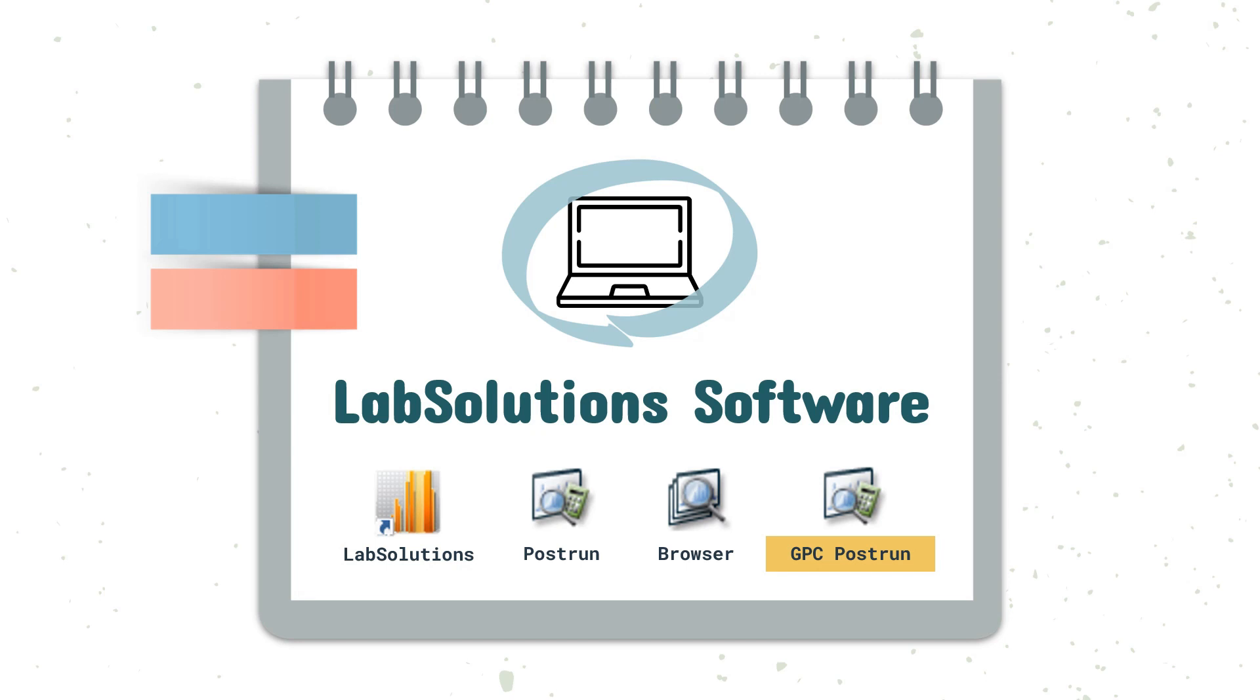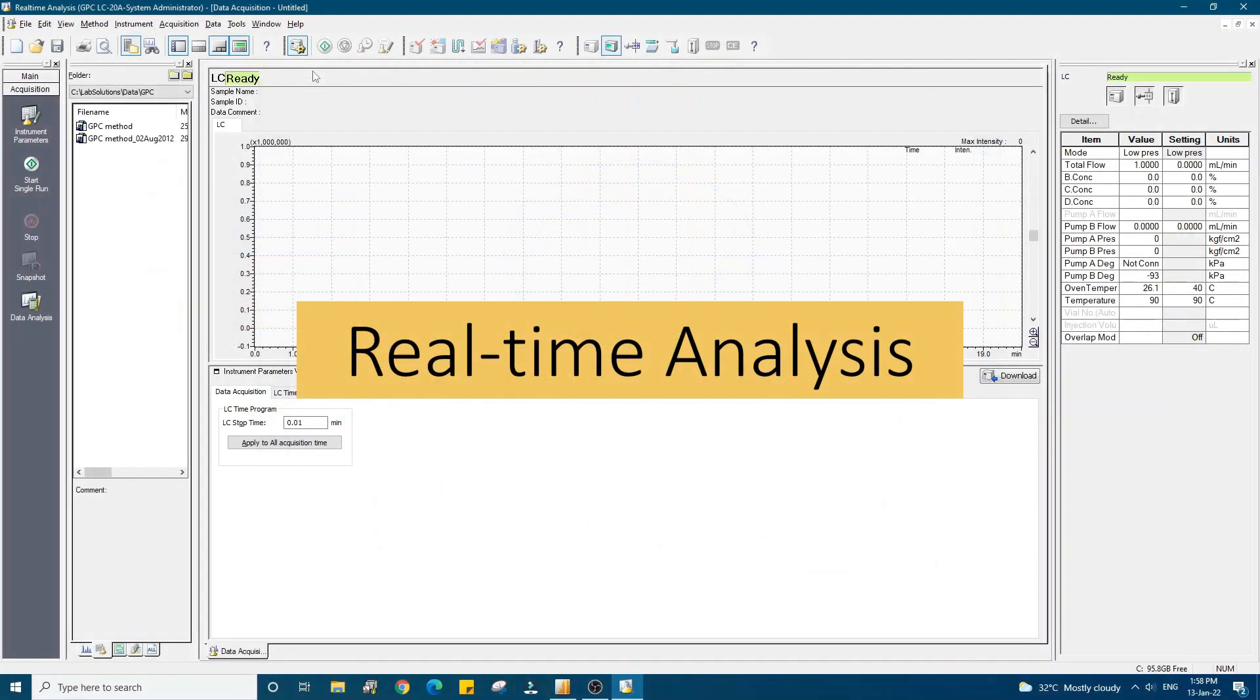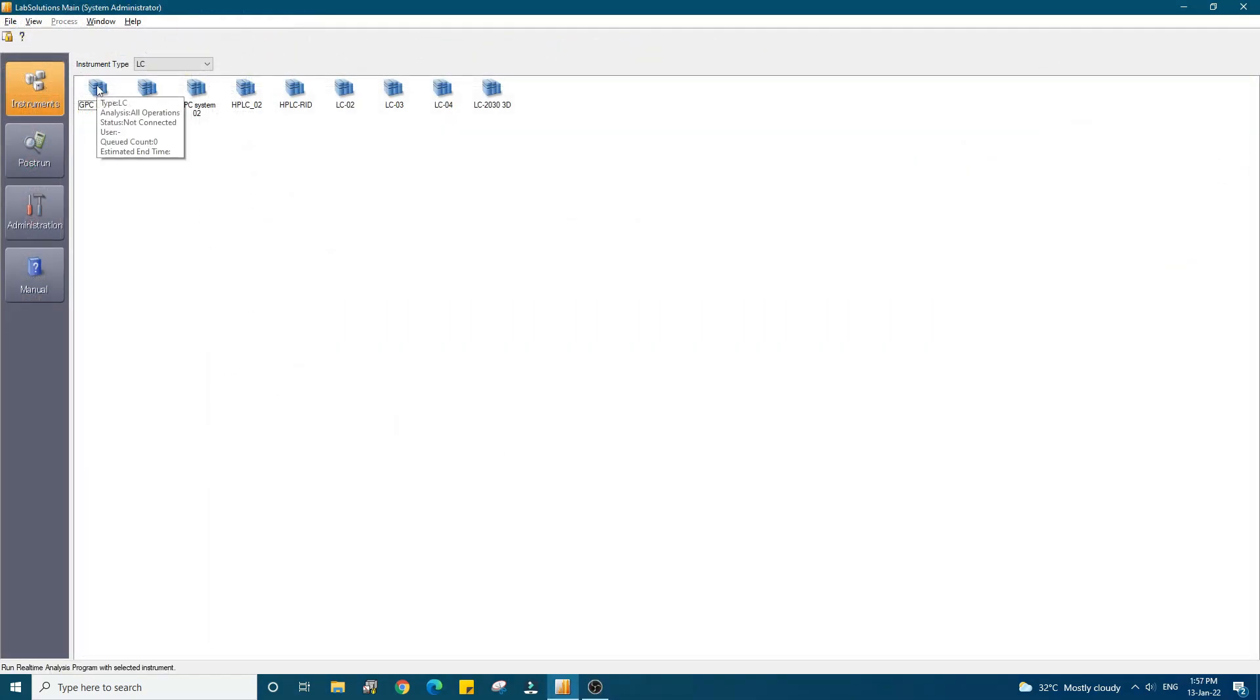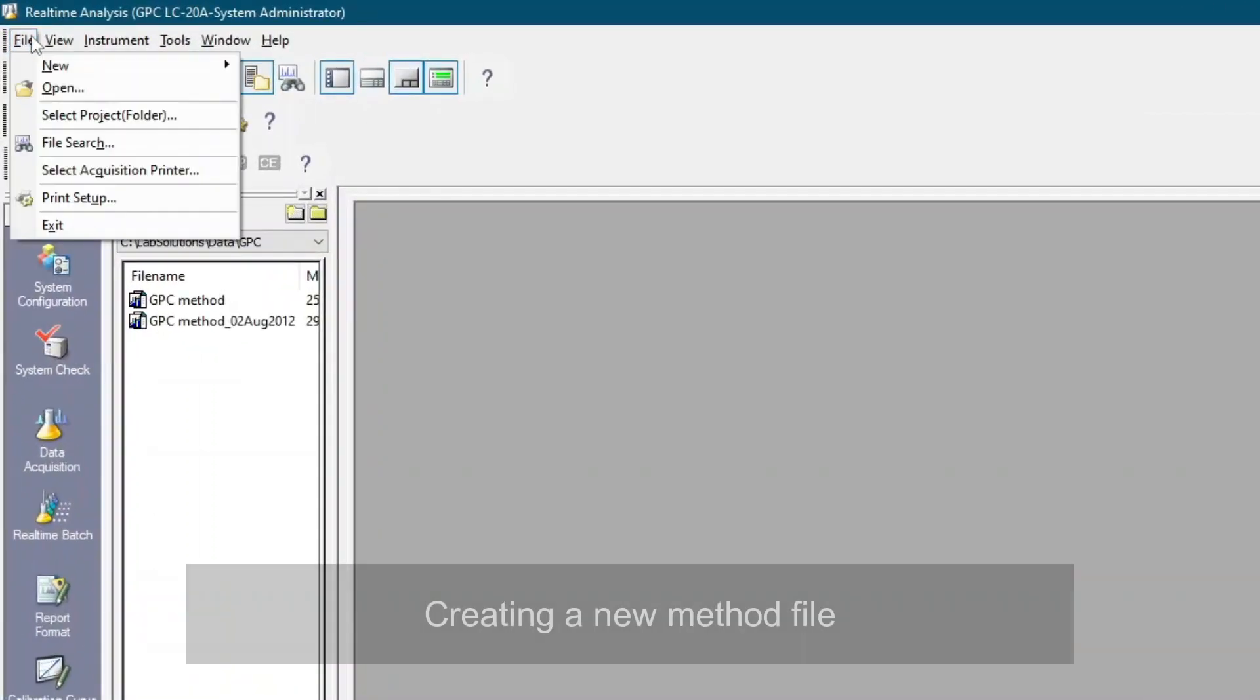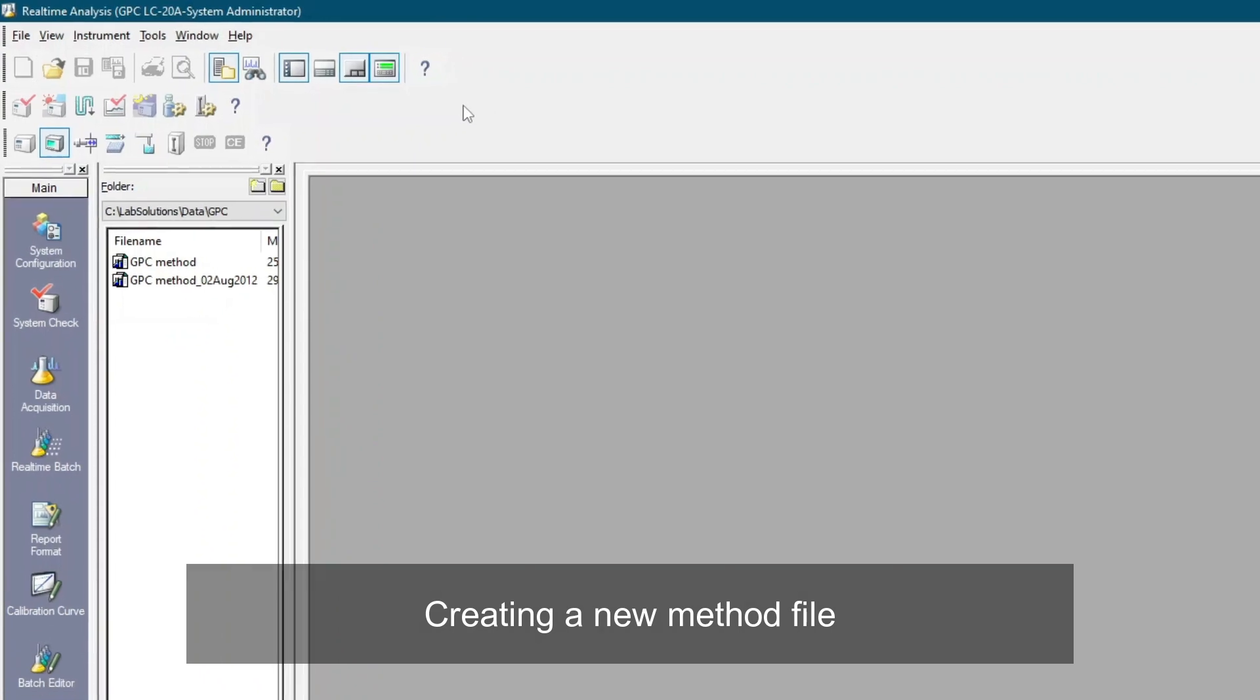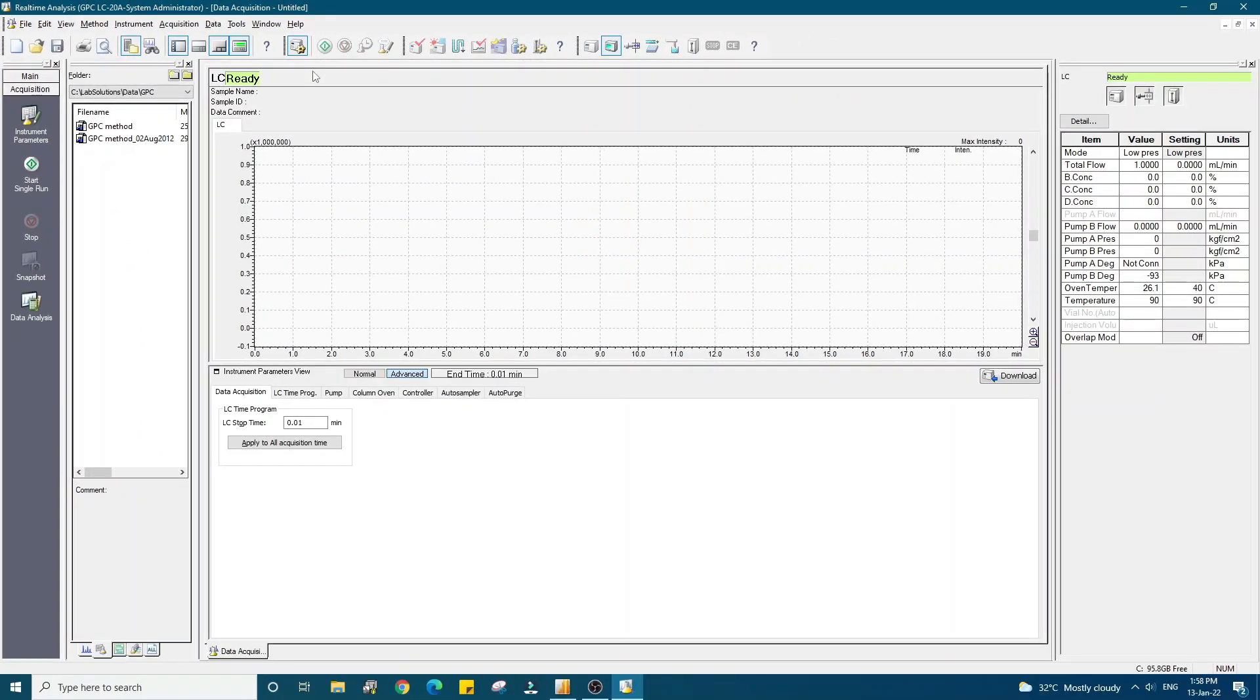The LabSolutions software is used to run the analysis. After the analysis is done, the data obtained is then processed by the GPC post-run tool found inside LabSolutions. Now let's move on to the LabSolutions workstation, starting from how to conduct a real-time analysis. First, we need to open the real-time analysis window and then create a new method file for GPC analysis. This method file will be used to analyze the GPC standards.